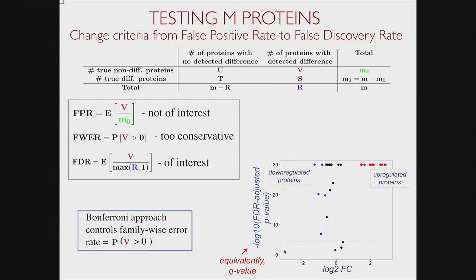So you have the log fold change on the x-axis. This is the practical significance. You have the minus log p-value adjusted for false discovery rate. A small p-value is good, right? But it's difficult to see small values. So minus log of that means that high means significant. It's just to be able to see it better. So this is statistical significance.